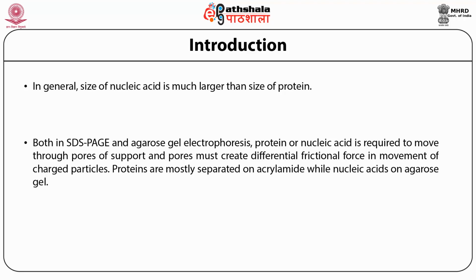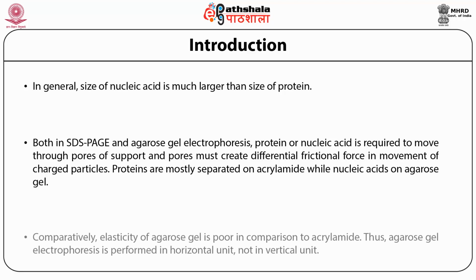Of course, small size nucleotides can be separated in acrylamide gel electrophoresis. Comparatively, elasticity of agarose gel is poor in comparison to acrylamide gel.